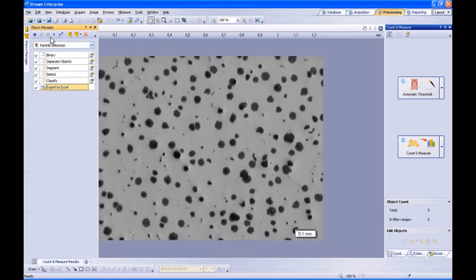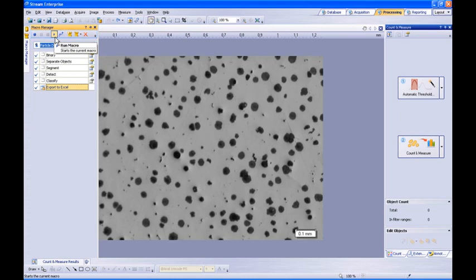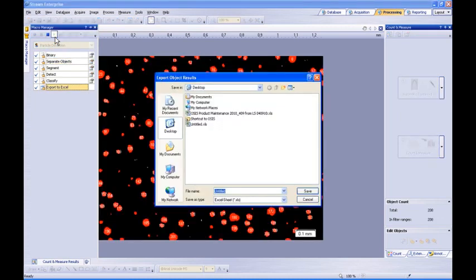To run this macro, or any pre-recorded macro, select it from the drop-down menu, then press play. The macro will now execute, stepping through each of the commands listed for that particular macro.